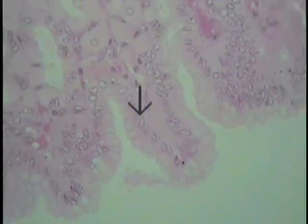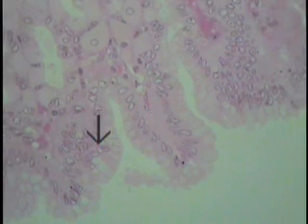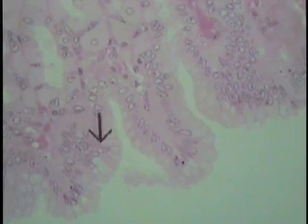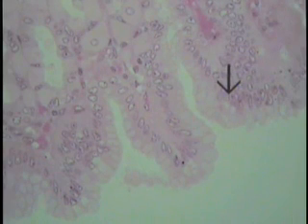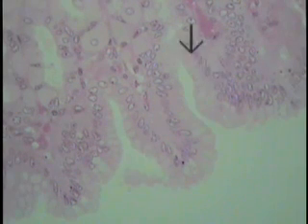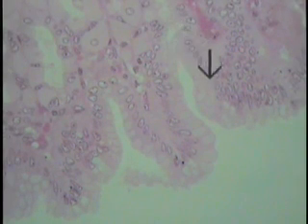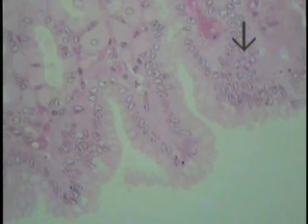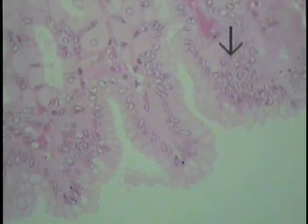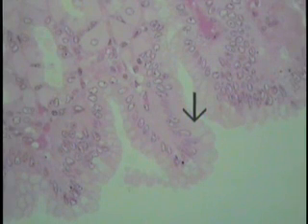Because this particular tissue is so folded, once we get beyond the area that was indicated by the pointer, such as here, due to the folding of the tissue, it looks like a massive collection of nuclei. But this is simply a fold in the tissue, and you're cutting through the tops of the cells, as indicated by the pointer here. The section would have gone through here, clipping the nuclei, so you didn't get a perfect perpendicular cut through the length of the cell, making it somewhat confusing at initial observation. This is a typical simple columnar epithelium.